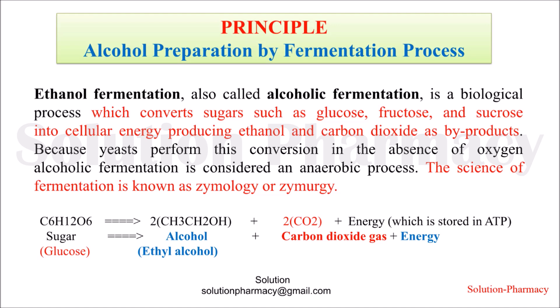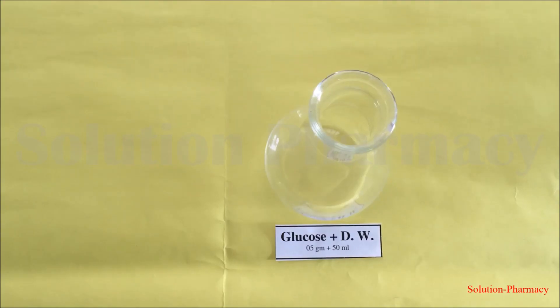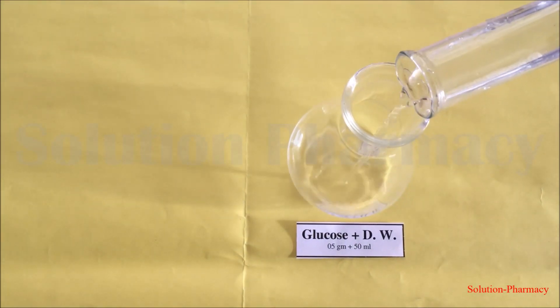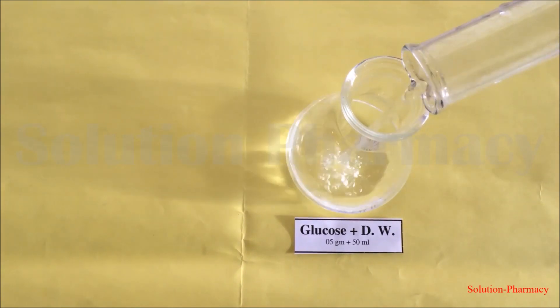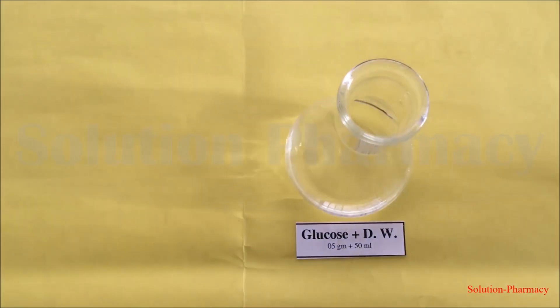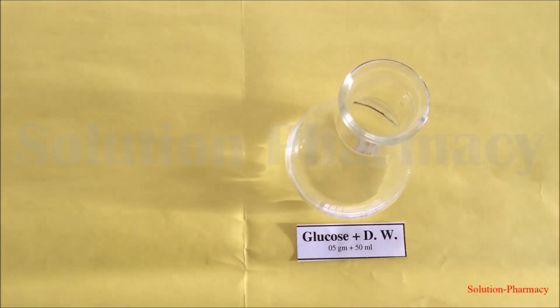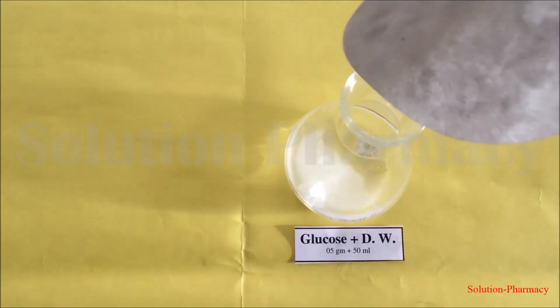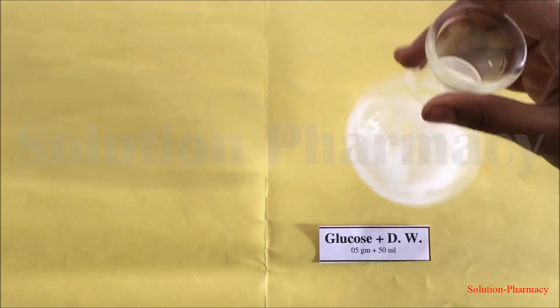The principle here is that this carbon dioxide, when it reacts with lime water, converts it to a milky white color. To start the experiment, add 50 ml of distilled water into a conical flask. If using plain water, first boil it, cool it, then use it. Then transfer 5 grams of glucose and swirl the conical flask so that the glucose dissolves.